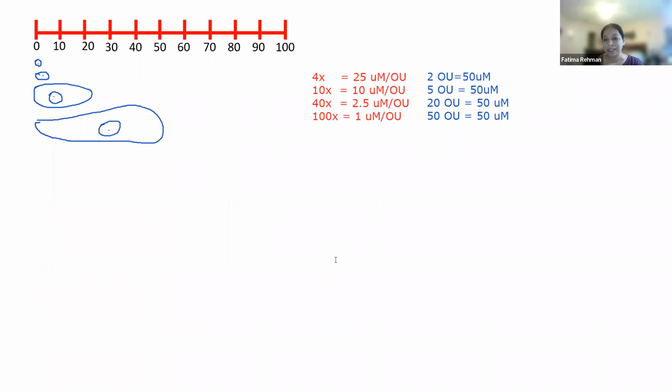What do you think we're gonna calibrate today? Since we do not have the ocular micrometer, what are we gonna be using instead? Remember, we have digital images, so what are we gonna do instead in order to calibrate and be able to measure actual sizes of cells, not just relative sizes of cells? Pixels. So yes, images are built with pixels in our digital world. So we are gonna be calibrating the pixels of our image to physical units of length in micrometers.